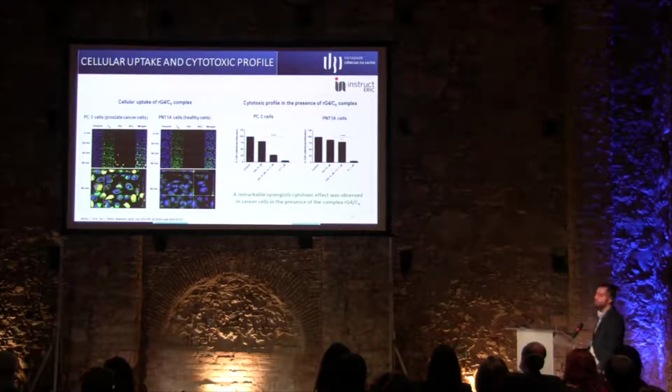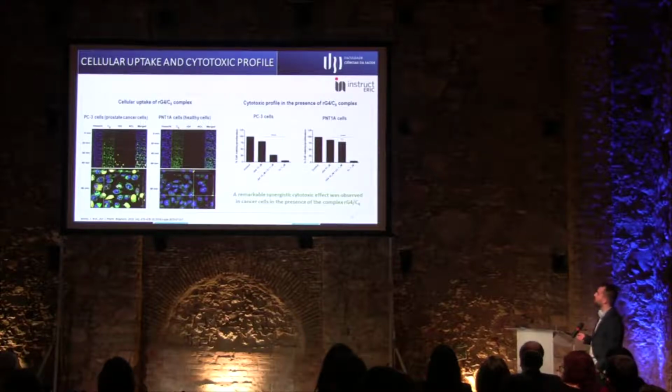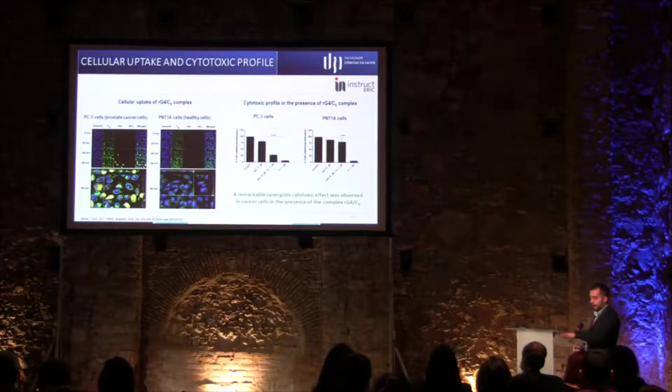Taking this into account, we proceeded to the cytotoxicity assays, the MTT assay, and we showed that a remarkable synergistic cytotoxic effect was observed in cancer cells in the presence of the complex, but not in the healthy cells.